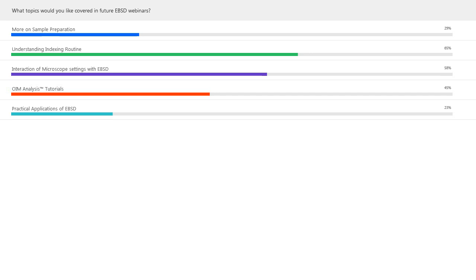Got a question talking about pre-treatment of the sample. In this case, there's no special pre-treatment of the sample needed. It is just a question of, it is what it is. We always tell you that you should try to start your sample with the best sample prep you can do. So if I'm dealing with a sample, we usually say, hey, you should be using a vibratory polisher on most of your samples to get the highest quality patterns. Because if I have the highest quality patterns, then I can collect better data, I can get better results, and in the end, I can get my goal.